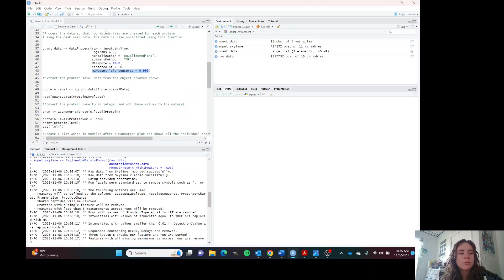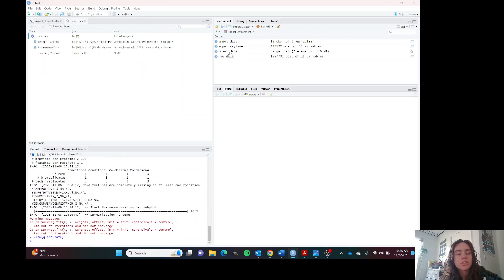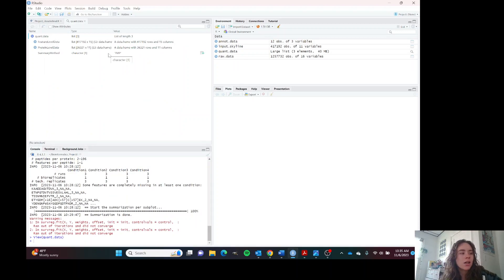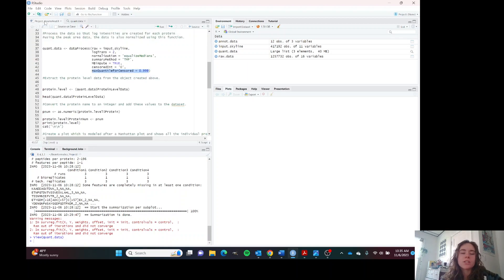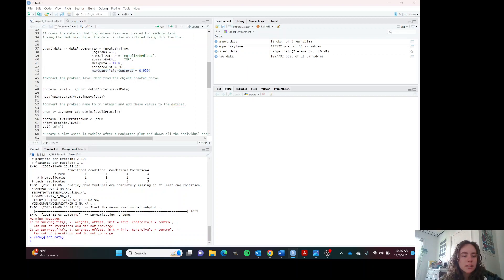Now we have processed data. If you look at the quant data, the quantification data that we've just processed, you can see it here. It looks like an object. It doesn't really look like a dataset that we're used to seeing. We need to extract the data that we want to measure from the object. This is what this line is doing here.